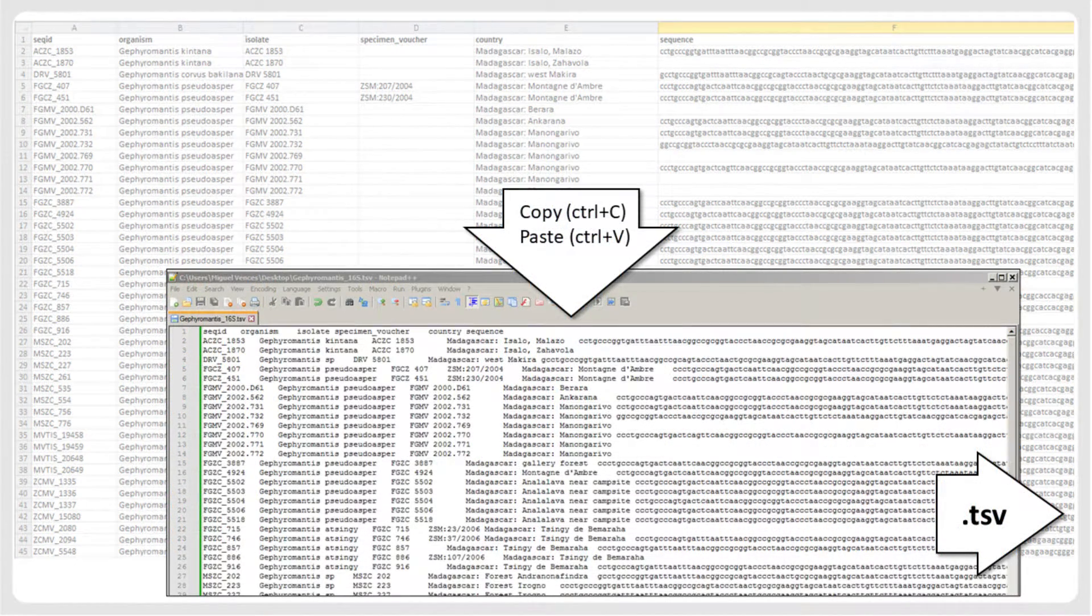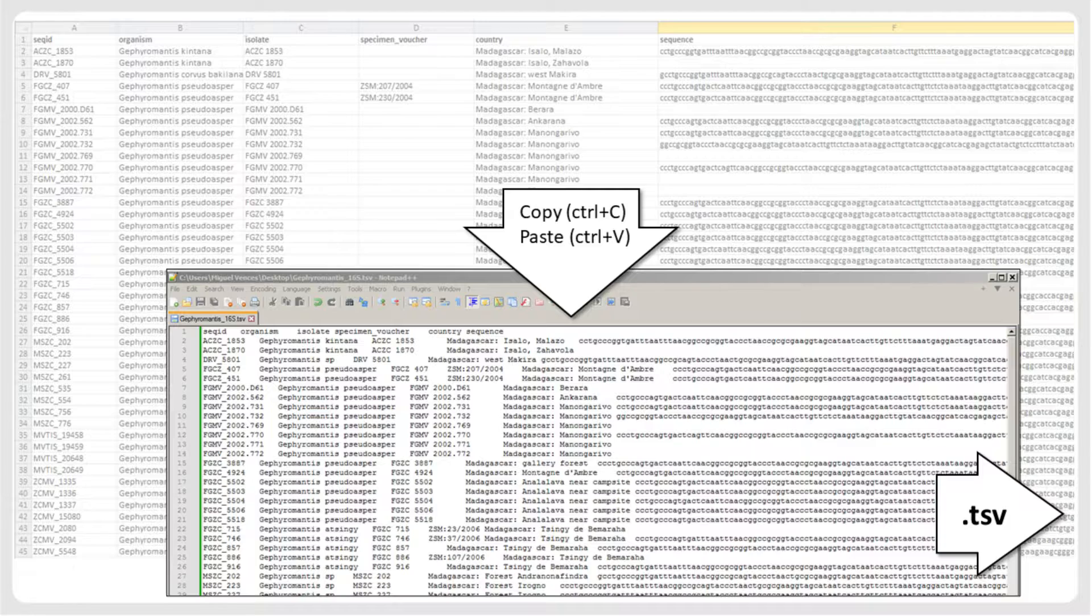Copy the sequences and metadata from your spreadsheet editor, paste them into a text editor, and save them as a tab-separated values text file, a so-called TSV file.